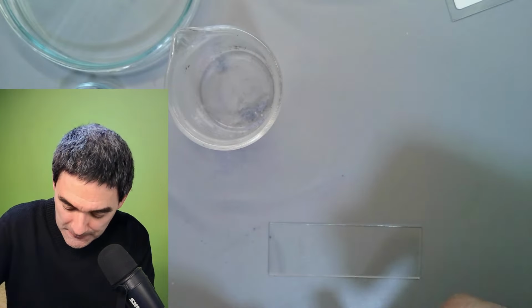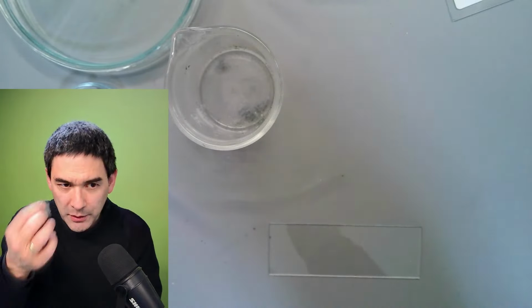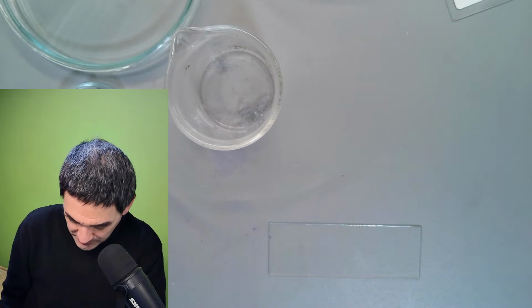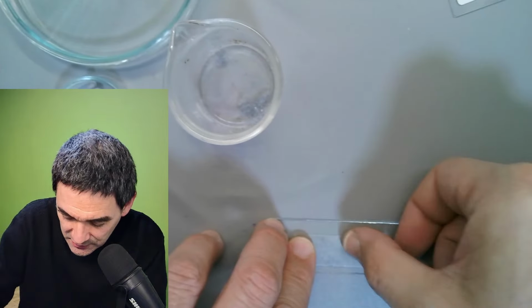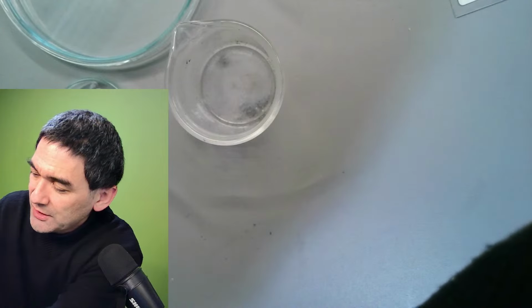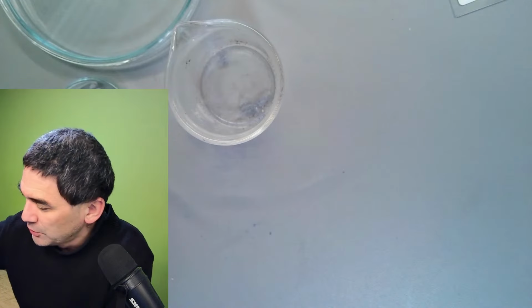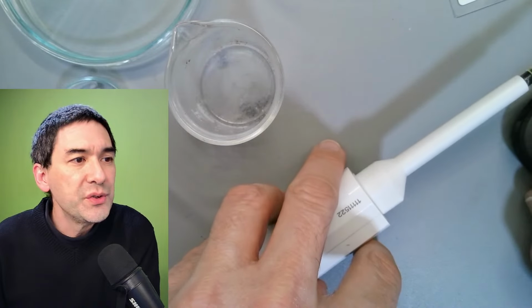You take a piece of tape, okay? You take a piece of tape and I'm going to put it on my jeans now. You cannot see that, but I'm just collecting a little bit of whatever is on my jeans and I tape it down over here, right? What we'll be looking at now is the edge here of the tape. I just want to show this to you because this was actually a little demonstration of something that people were really worried about. Let me put that soldering iron away, otherwise I'm going to burn myself.